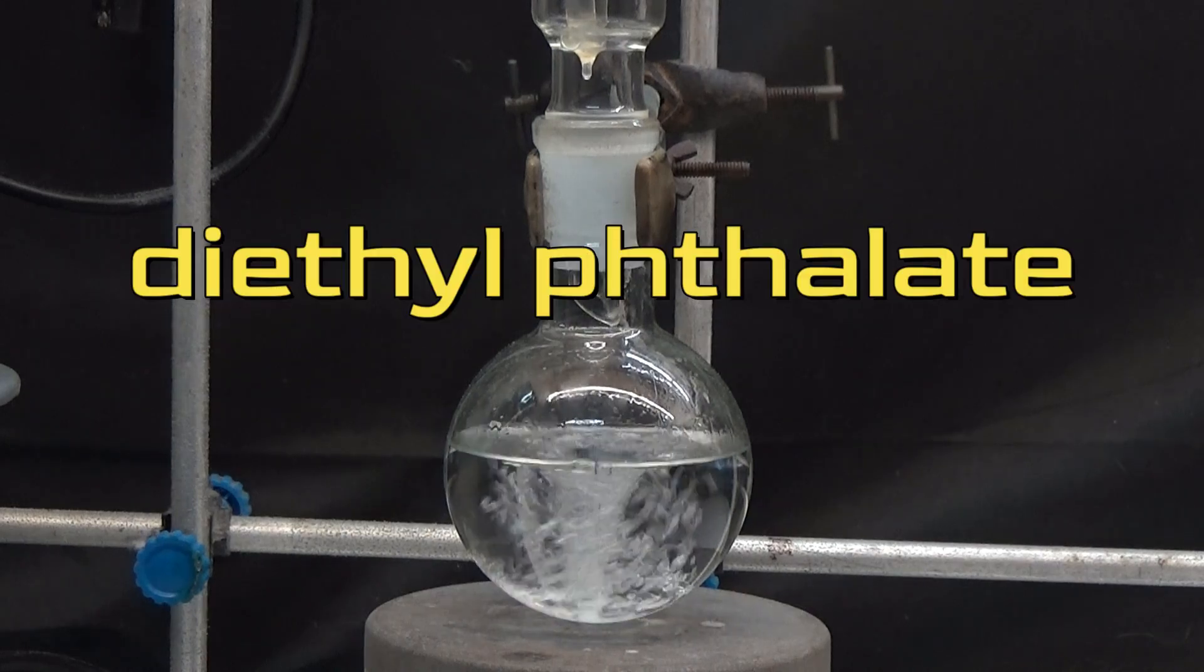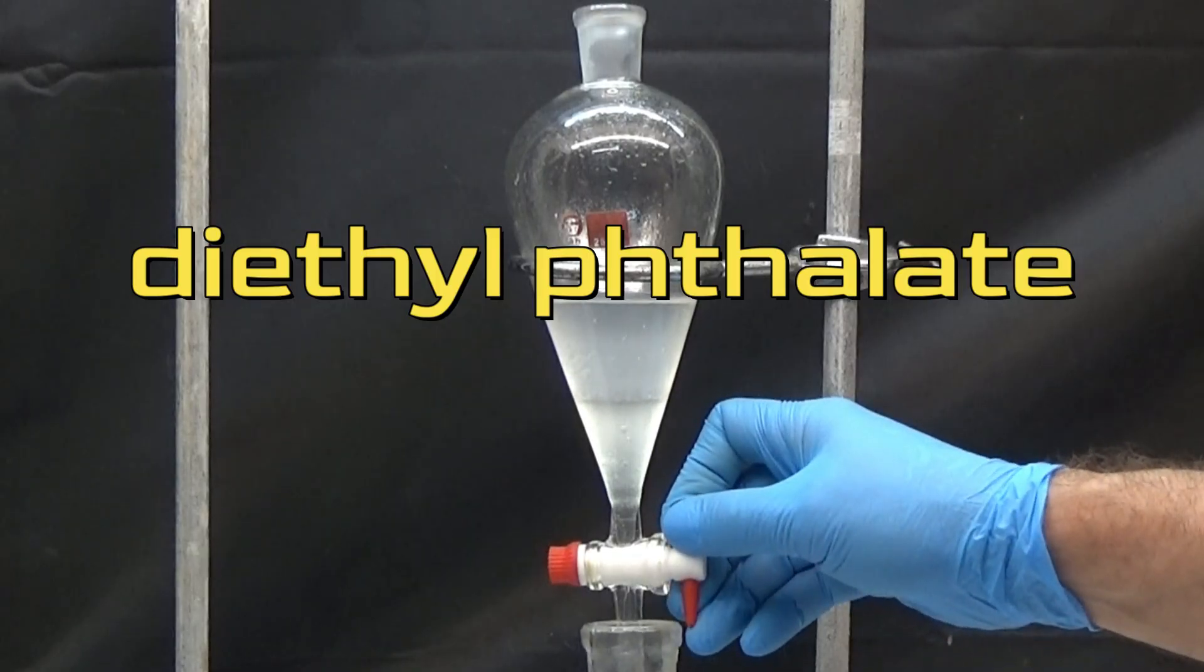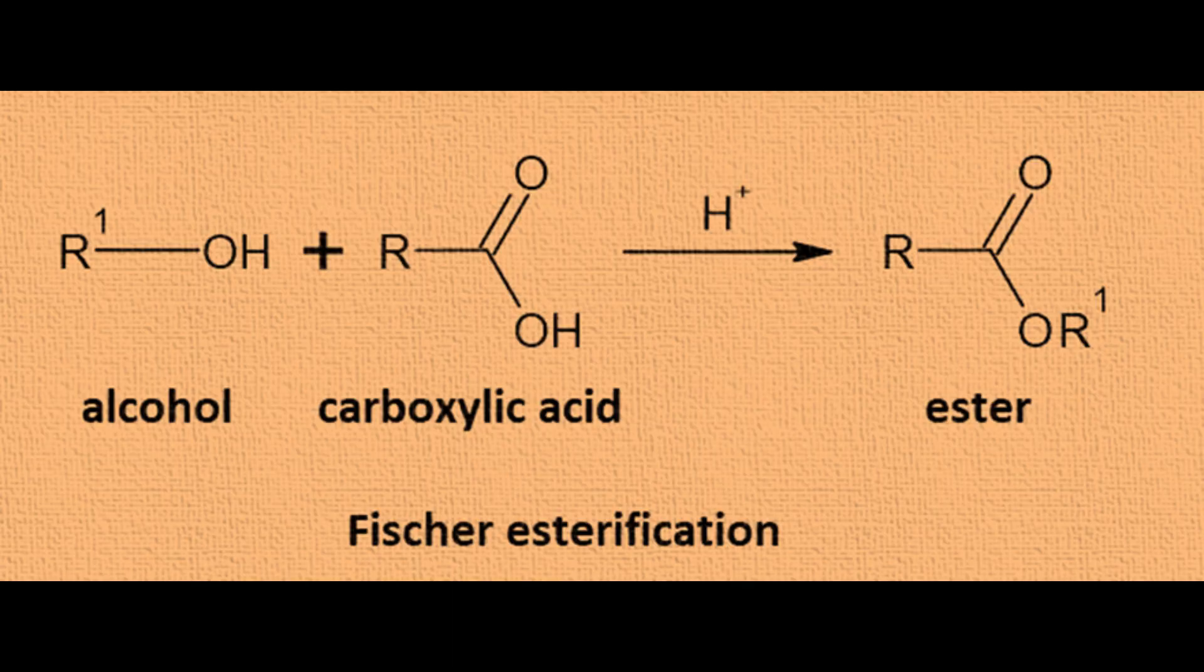In this video, we will obtain diethyl phthalate by Fischer esterification. Fischer esterification consists of the formation of an ester by refluxing a carboxylic acid and an alcohol with an acid catalyst.